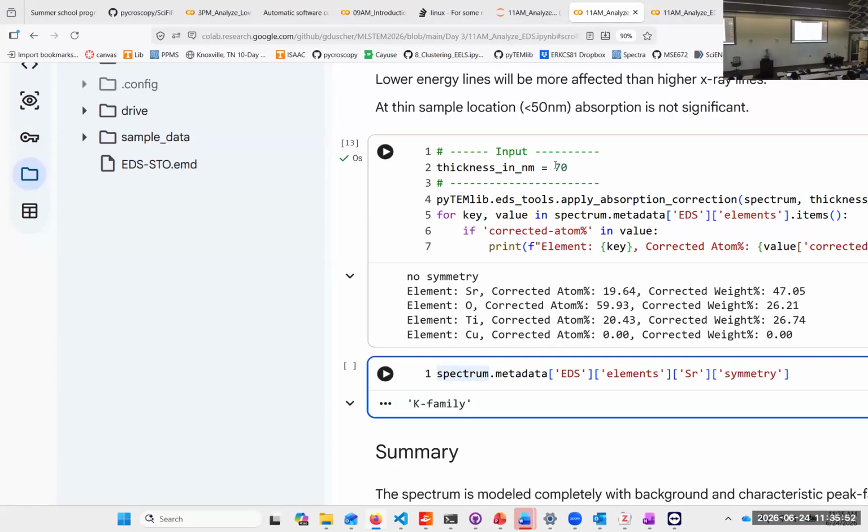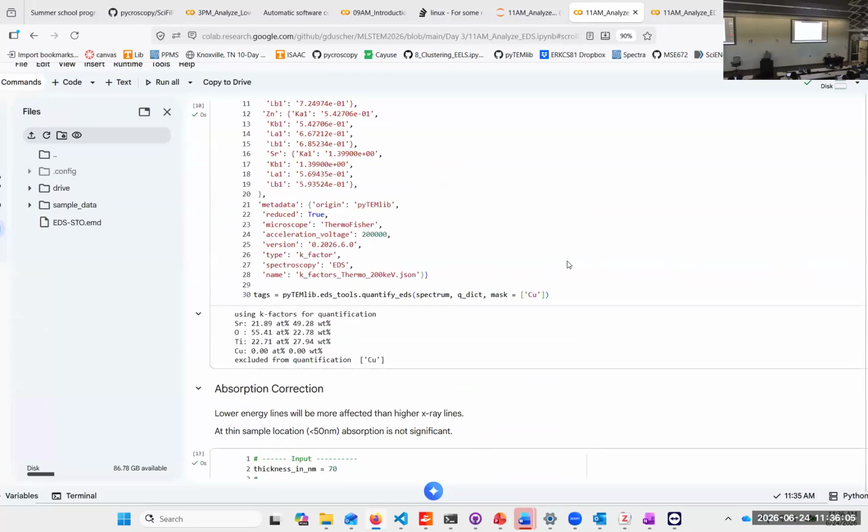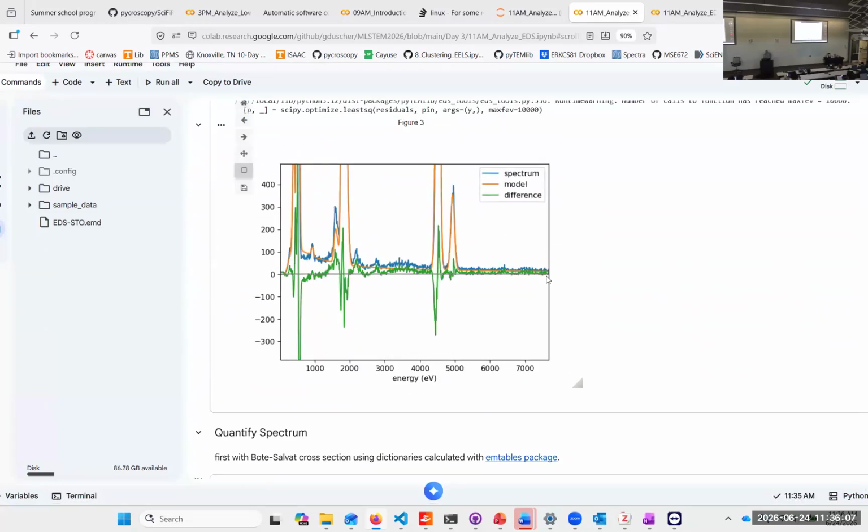And before you trust it too much, you really, really have to check your fit, because that is really where we are basing everything on. So let's look back into my fit and see, okay, there's plus minus. So my fit is actually quite nice and good, and I can trust it relatively well. So again, the quantification is quite clear.